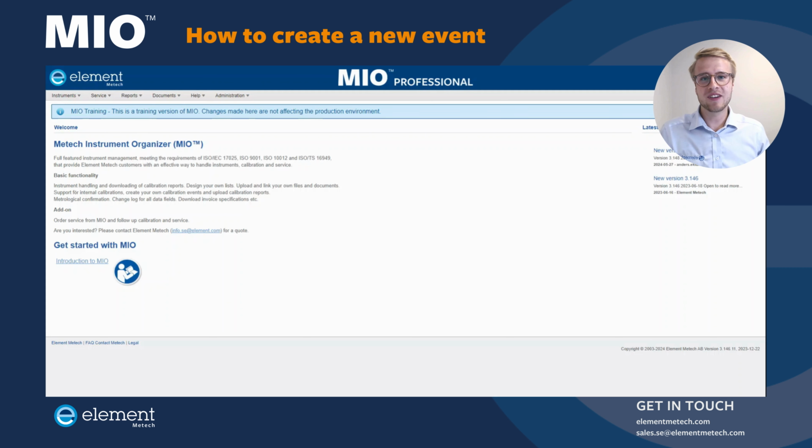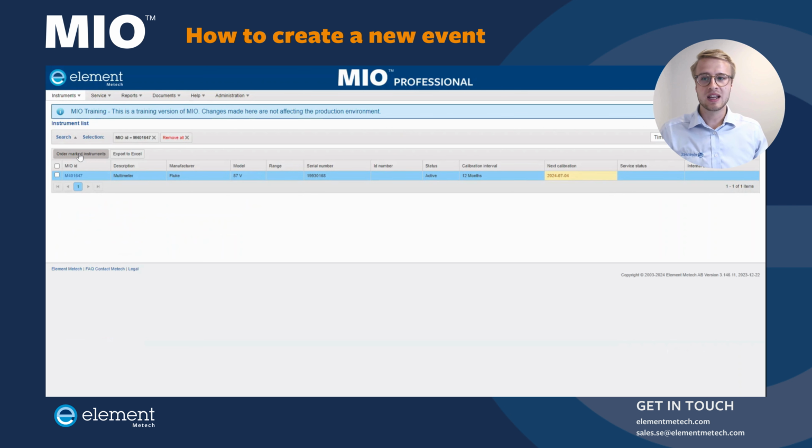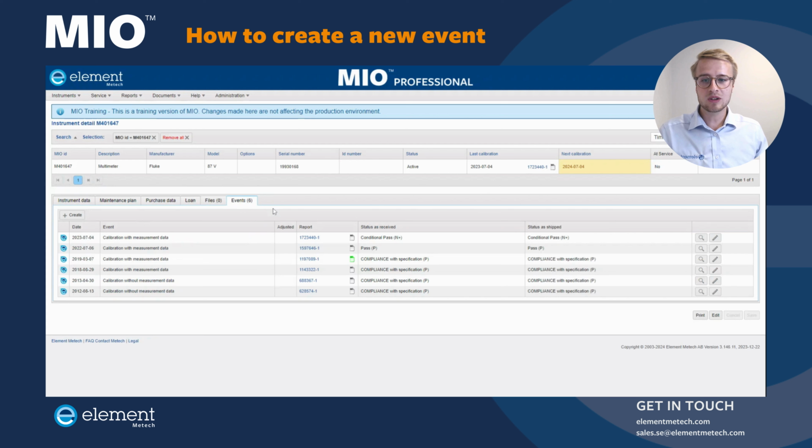So first, let's find the instrument. So I'm going to go into the instruments module to the instrument list. Here I'm searching for my MIO ID and I'm going to click on it. We're going to the events tab, and as you can see here, we have some previous events that has been registered for this particular multimeter. And if you click on the repo number, you will automatically download the certificate.